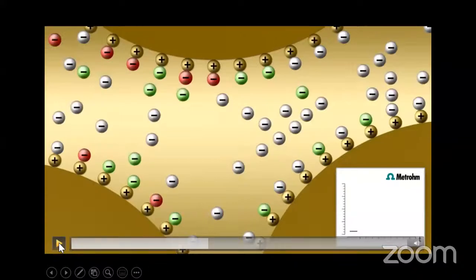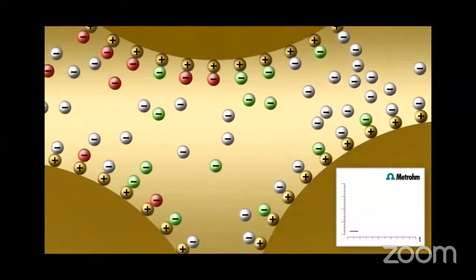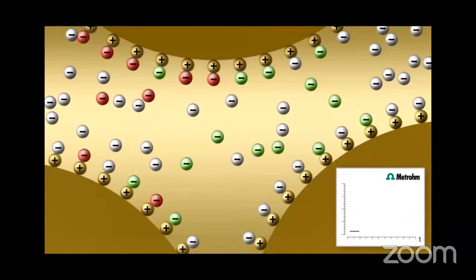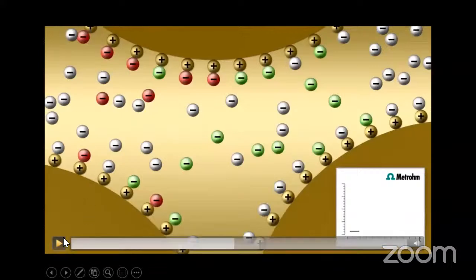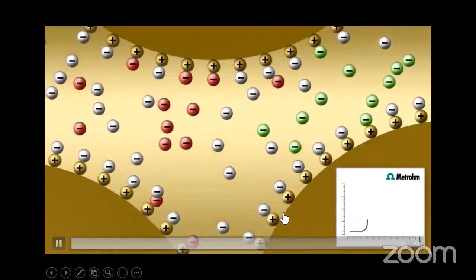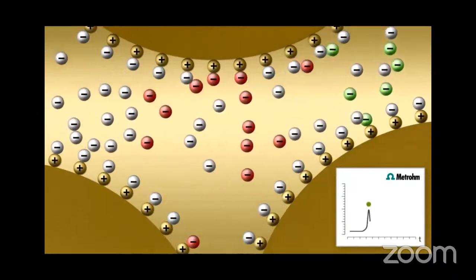Further, we move. What exactly happens is that when a chloride ion is attached to the basic anion column, there is a competition between one Cl- ion and several carbonate ions. Carbonate ions will try to elute it out and occupy this space. There will be competition from several carbonate ions, like 10% trying to push 1%. It is the law of mass action. So at a particular point, Cl- ions start moving out and you get a chromatogram here. You can see the peak rises, and that's the Cl- ions.